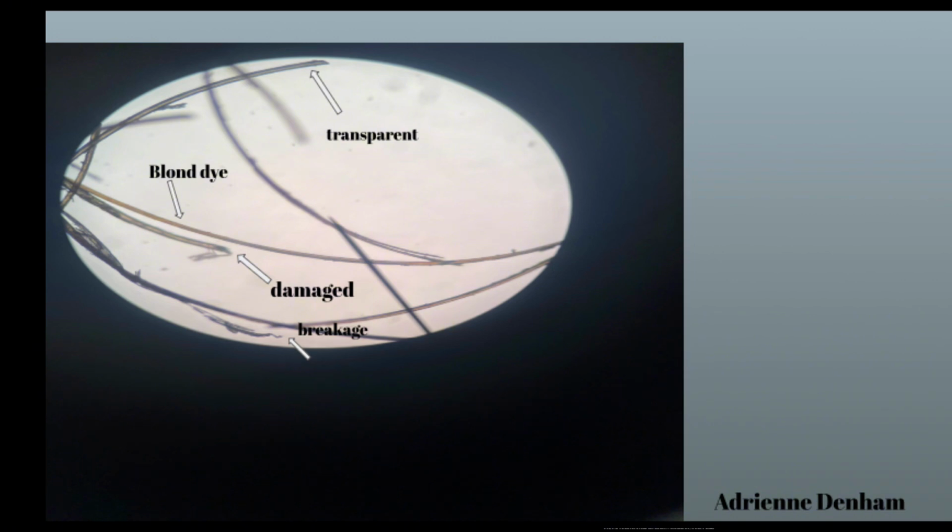This is off topic, but something else I wanted to add was that when me and my team were looking at Jaden's hair, he had a purple outline around his hair. As we know, the purple outline indicates bleaching the hair, so why would Jaden have this purple outline? We said that it could be from sun bleaching because Jaden is outside a lot. So this could be one of the possibilities.